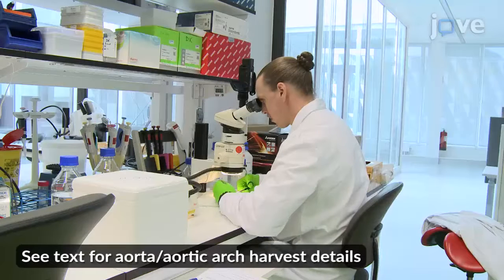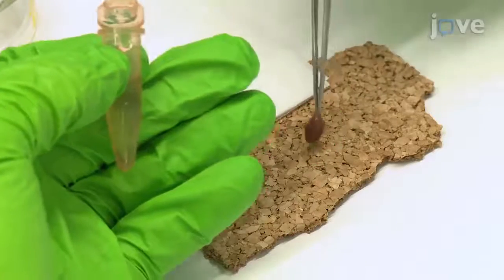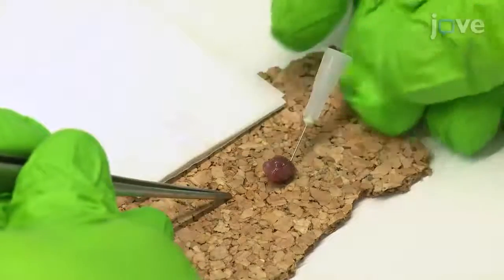After harvesting a mouse heart according to standard protocols, place the heart on a cork bed ventral side up under a dissecting microscope and use a needle to fix the heart to the cork through the apex.